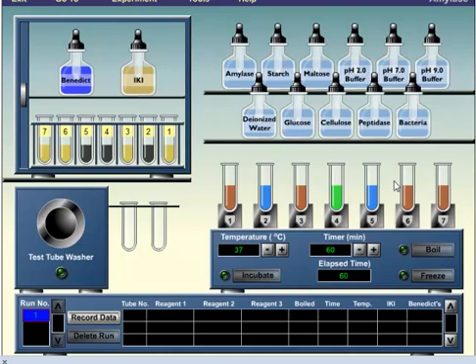Now we're going to boil it for one hour. Notice the color change in each one. In the presence of glucose, when you add Benedict solution and the tube also contains glucose, the color changes to reddish brick color after boiling.